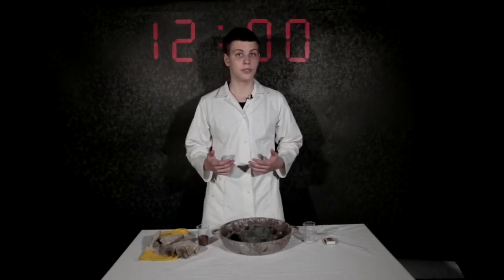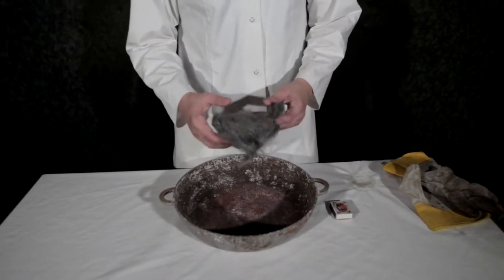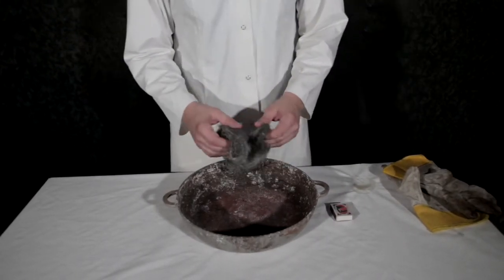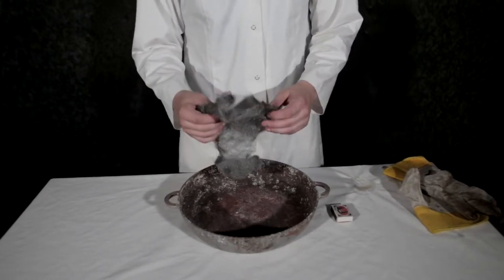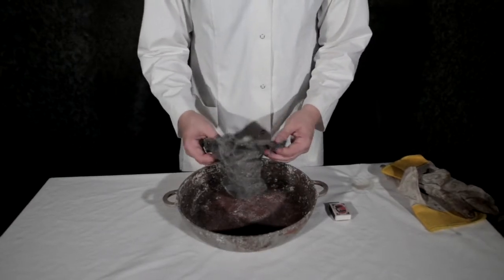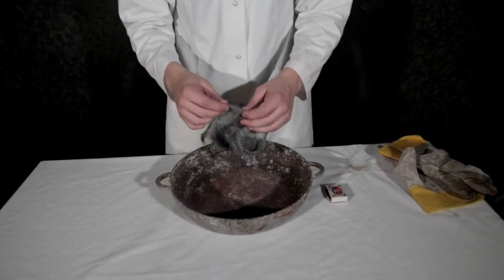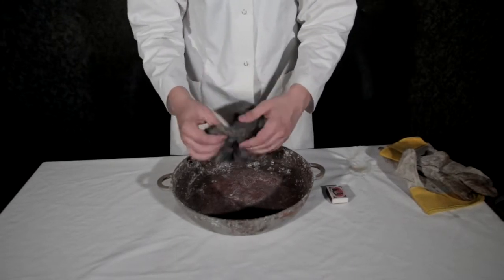In this video, I will present the reductant properties of the iron, as well as the oxidative properties of its compounds. From the beginning, I need some steel wool, which cannot be found in my country, but luckily for me, I have ordered it online and bought it from Great Britain. It's sold like a steel sponge in every other household products shop. The experiment is based on the process of iron burning, which has the shape of thin metal fibers.